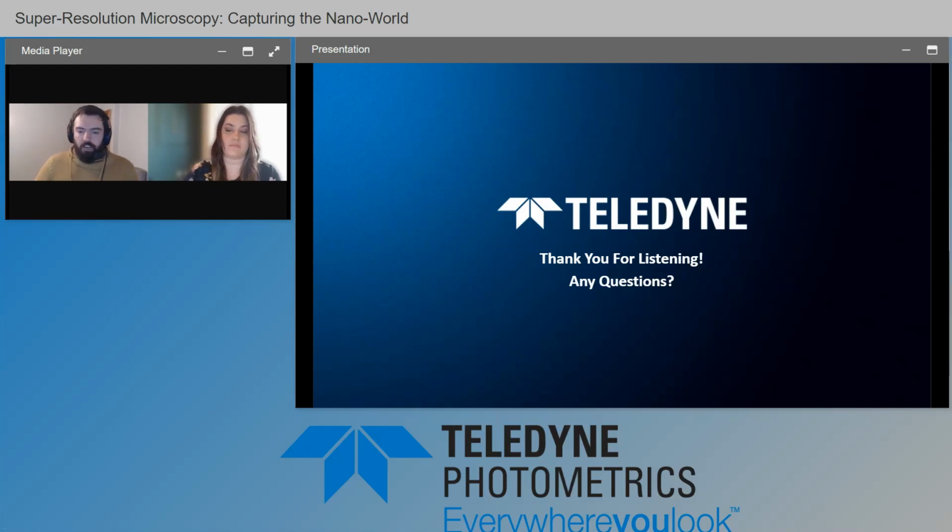But I imagine the number of people who have a traditional fluorescence imaging system that can then be converted into a super resolution system is far more than the number of people who have access to an electron microscope, for example. I think if electron microscopy was as easy to access as common wide field or fluorescence microscopy is, then more people would be using it for this kind of thing.